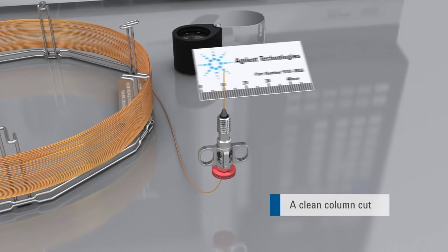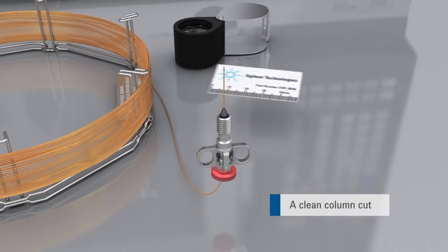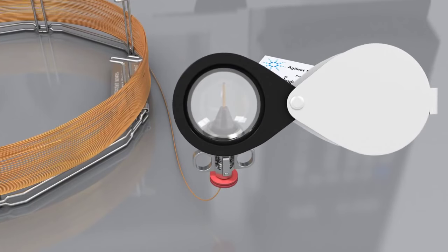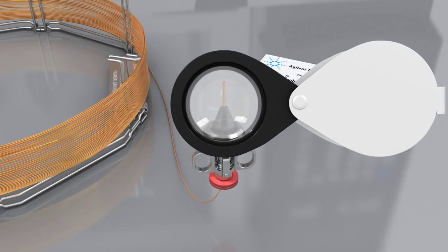Carefully trim the end of the column using a column cutter. Ensure the column cut is at a right angle to the tubing wall and that the end is free of chips, burrs or uneven areas.